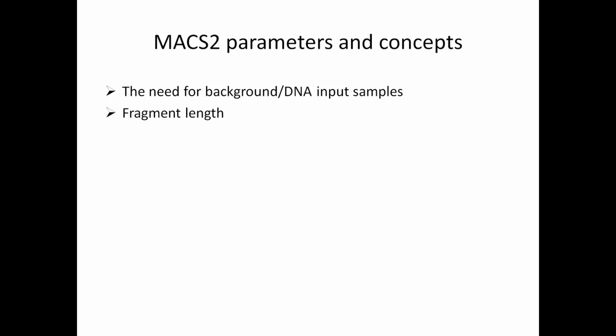When paired end reads are used, the length of the DNA fragments are actually known. Simply put, MACS2 is looking for regions of the genome where ChIP fragments are clustered more than the input fragments are in the same region. Of course, nothing's ever simple, and the authors have tried to model in the fact that the genome is not homogeneous and that some areas will be bound greater than others. So if cross-correlation fails, you can opt not to build a model and specify your own fragment size.